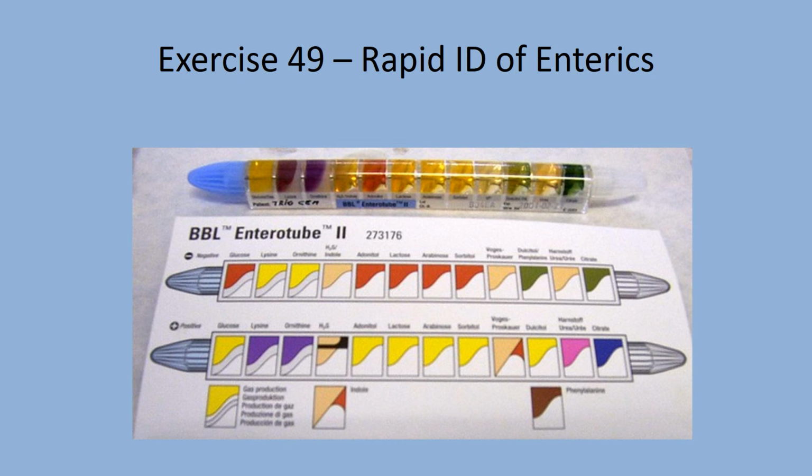All of those previous tests are under the video links if you wish to see the tubes inoculated and see what a positive versus a negative actually looks like.